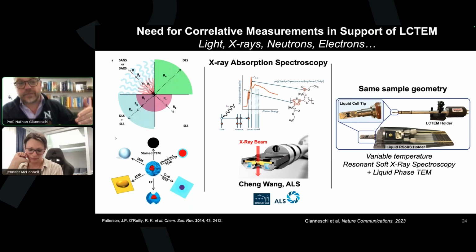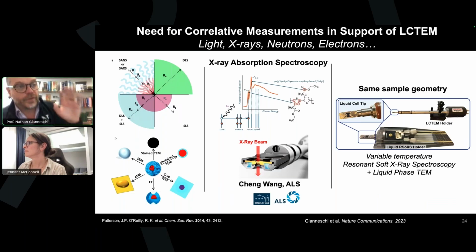Now, in the case of some of the more crystalline materials, you then have a whole other set of methods because you might know something more about the actual structure of it. For amorphous materials, that's why we've kind of harped on about these other kinds of approaches. So in this particular example, we used this kind of fancy setup at ALS, but really if you're looking at dynamic processes, you want to understand them by combinations of scattering and mass spectrometry and everything else that I described. Then you're asking a defined question about a material.